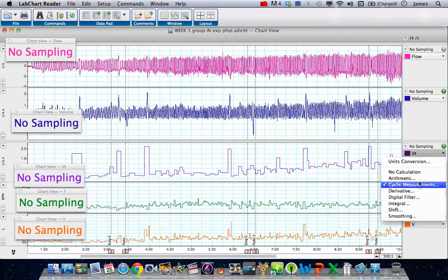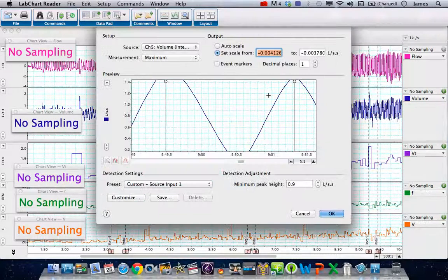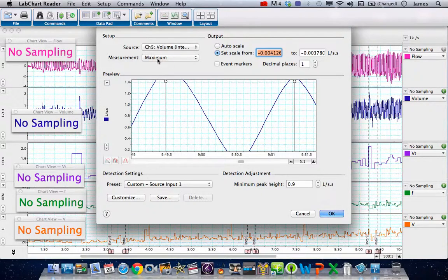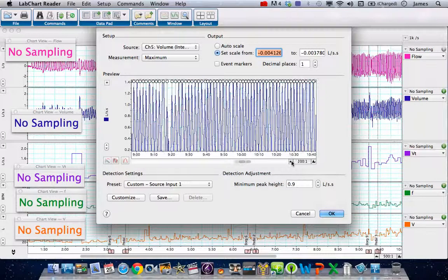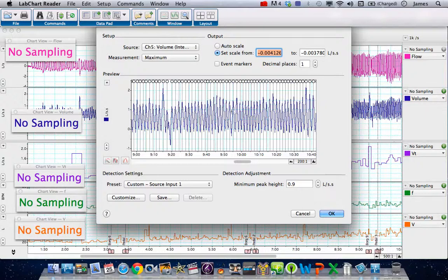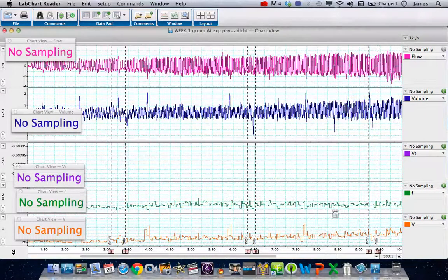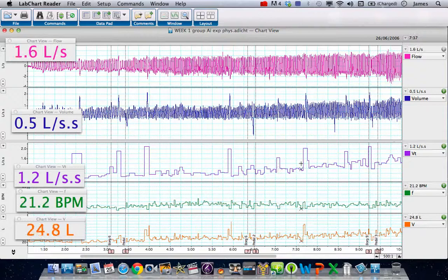How do we work out what our tidal volume was? Well we added another channel, used a cyclic measurement where we took the volume channel and reported the maximum at every respiratory cycle. So what you've got here is a series of measurements where it's looking at the maximum peak and working out what the tidal volume was. It's as near as it needs to be for this kind of thing, and there we have the tidal volume.